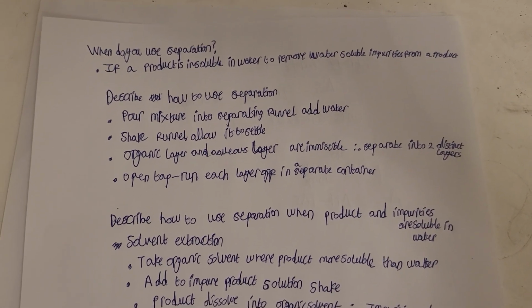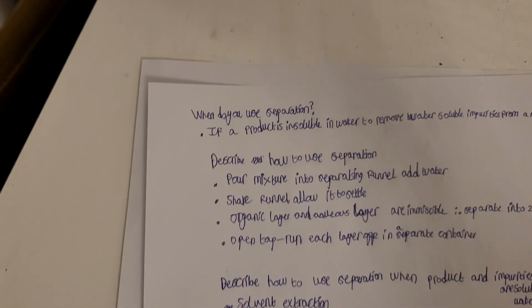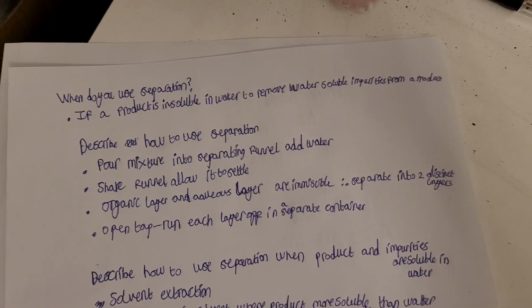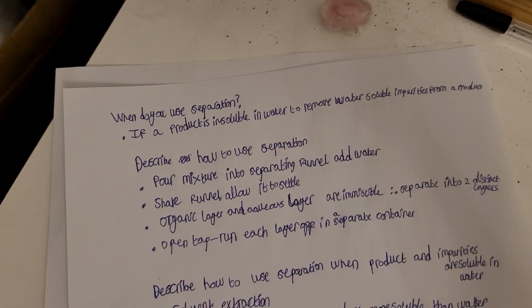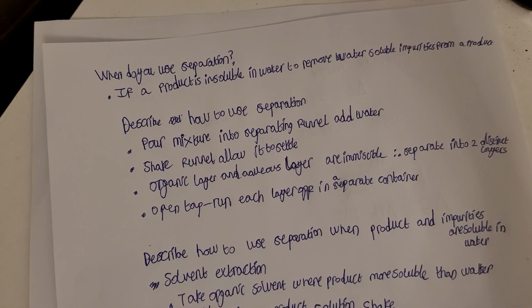When do you use separation? Well, we use separation if a product is insoluble in water, to remove water-soluble impurities from a product. How to use separation when the product is insoluble in water?